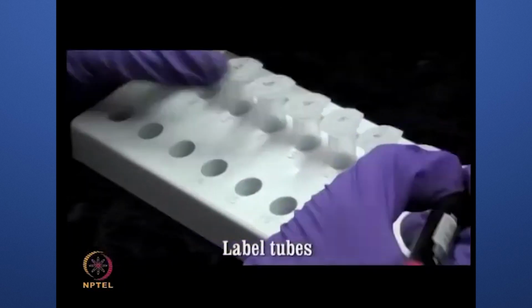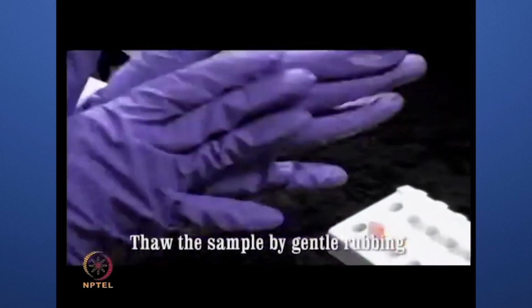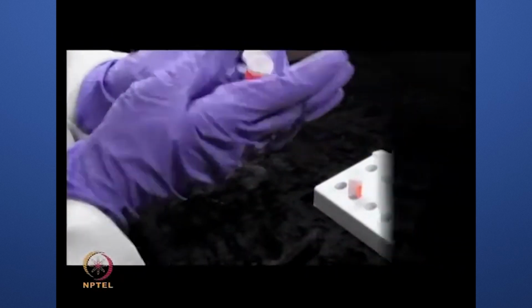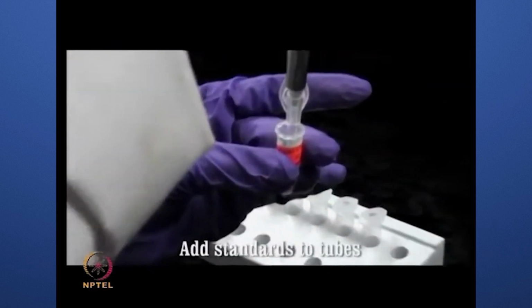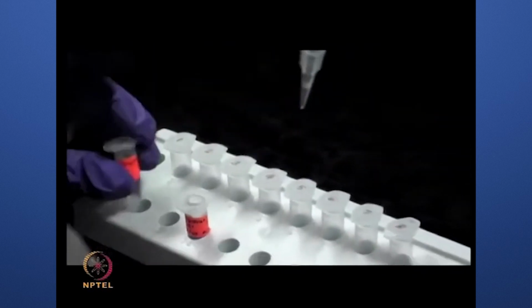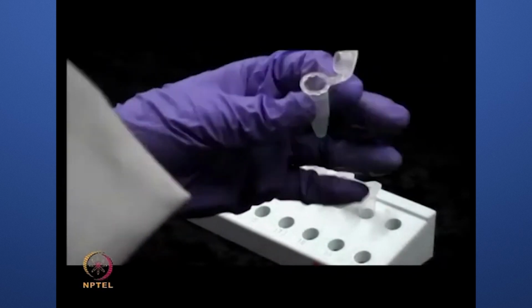Label the tubes suitably for standard and test samples. Thaw the protein sample to be quantified by gently rubbing it between the palms. Prepare the sample buffer required for diluting samples during the assay and mix it well. Add an increasing concentration of standard protein sample to each of the designated tubes. Bovine serum albumin is often used as a standard.